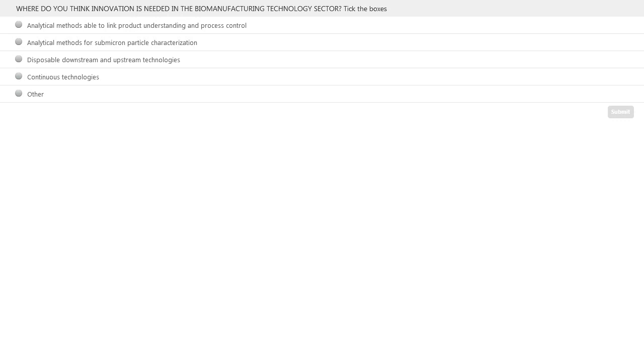The question is, where do you think innovation is needed in the biomanufacturing technology sector? In analytical methods able to link product understanding and process control, analytical methods for submicron particle characterization, disposable downstream and upstream technologies, continuous technologies, or other?